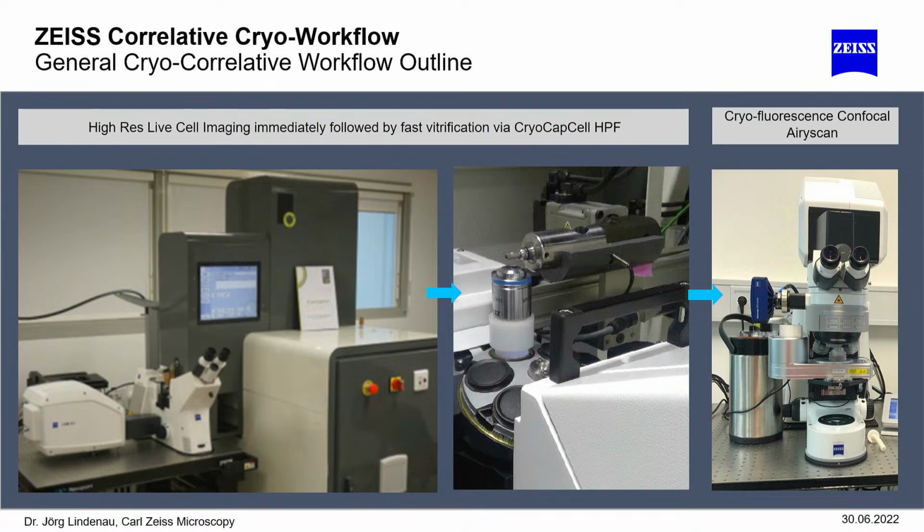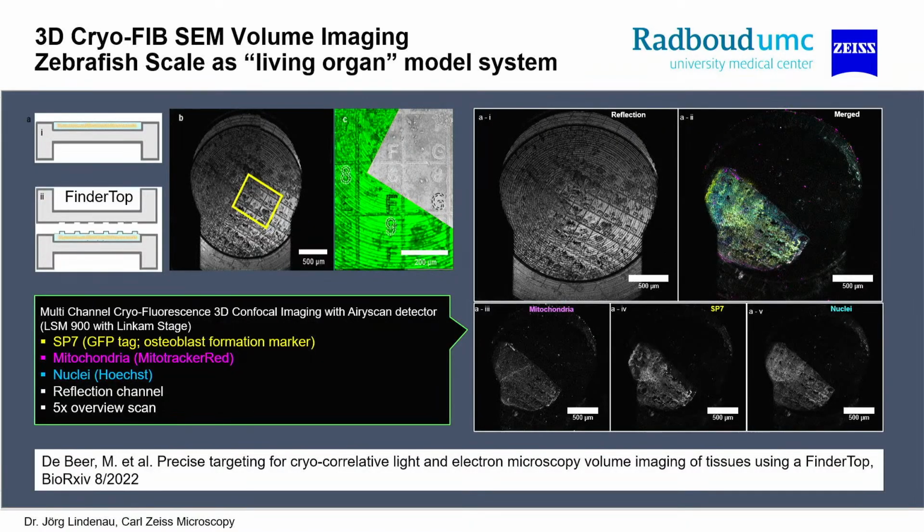So the time resolution of this workflow is about 1 to 2 seconds, and then it goes into the cryofluorescence microscope. One important thing here is that of course you need to have a reference contrast between the cryo imaging in the fluorescence microscope and in the crossbeam later.